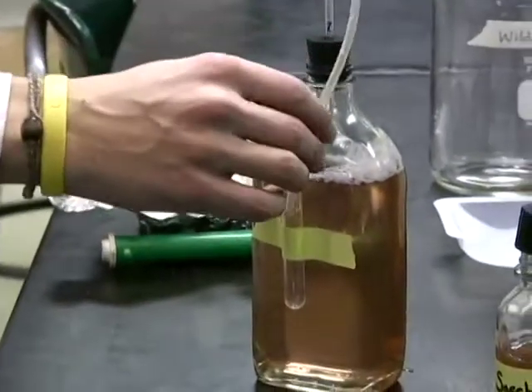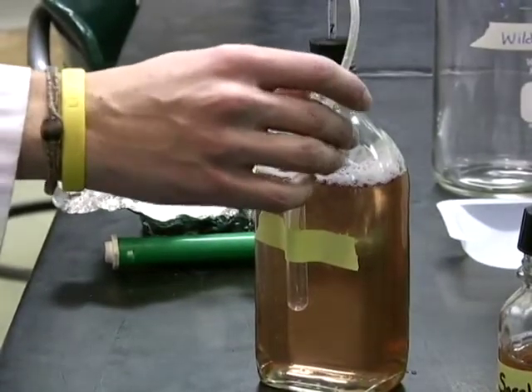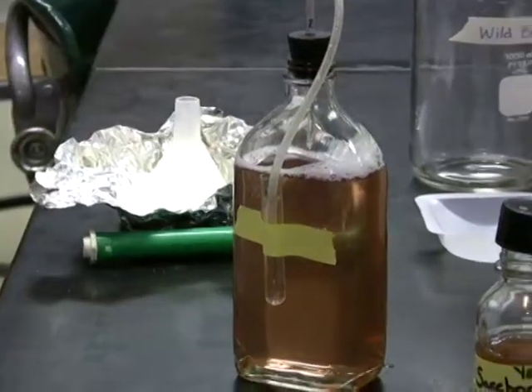We will incubate the bottles at room temperature for about 21 days and record the specific gravity several times throughout the incubation process. Thank you for joining us.